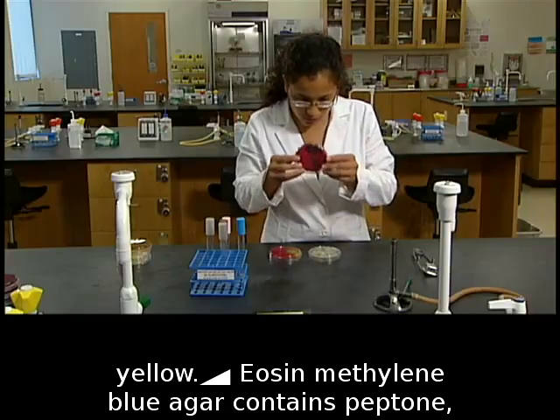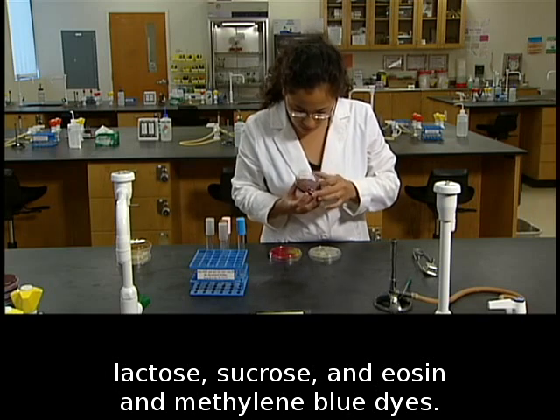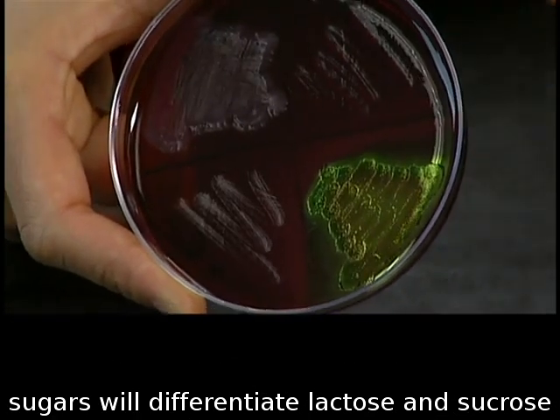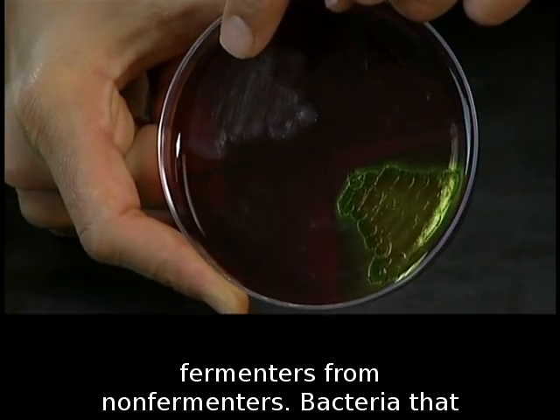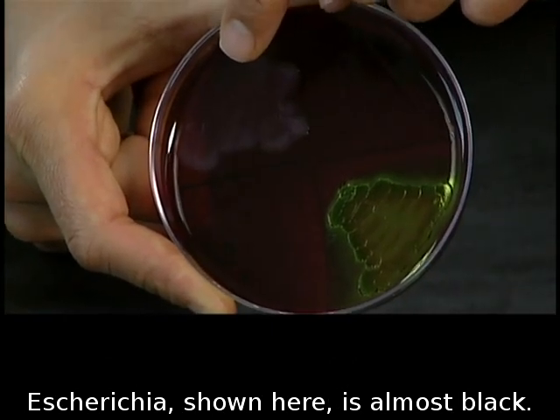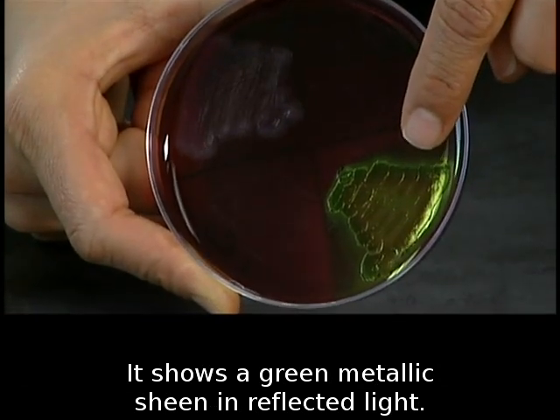Eosin methylene blue agar contains peptone, lactose, sucrose, and eosin and methylene blue dyes. The dyes select gram-negative bacteria, and the sugars will differentiate lactose and sucrose fermenters from non-fermenters. Bacteria that ferment one or both sugars will have dark centers. Escherichia, shown here, is almost black. It shows a green metallic sheen in reflected light.